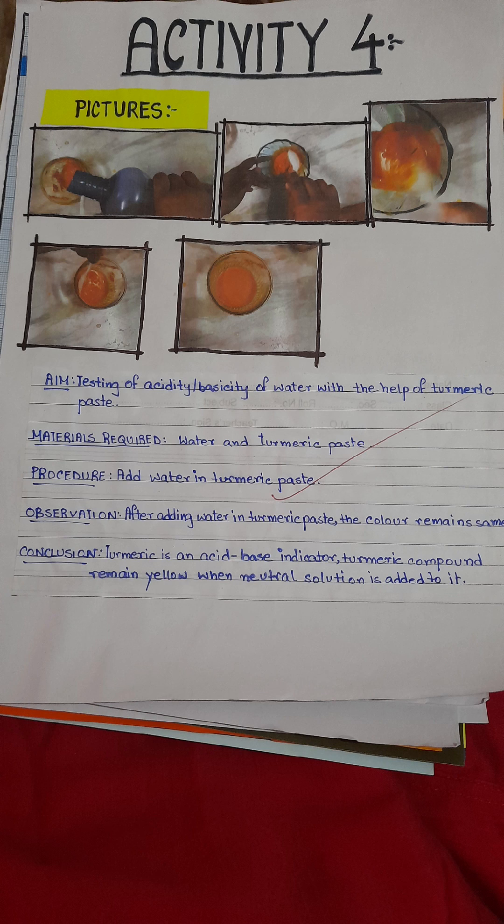This is activity four. We will test water with turmeric paste. As we know, water is neutral, so there will be no change in color.